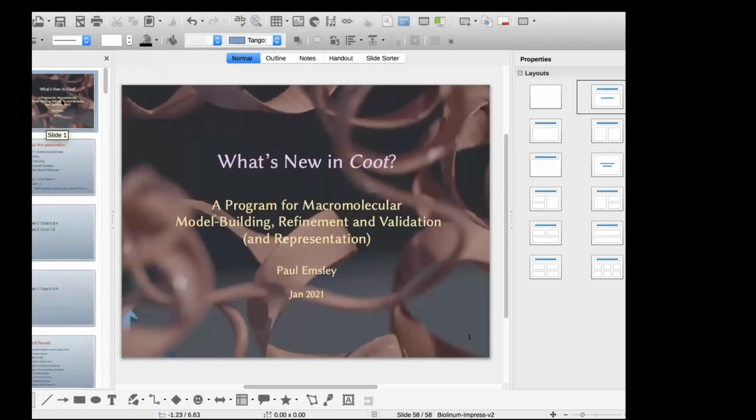This one here, that one has the geometry exported from Coot and rendered in Blender. So I thought that it would be a waste of my time and my skills to try to emulate sophisticated lighting and rendering and ray tracing program inside Coot. So the way to do it is to export it to a program that does do this, which is Blender.